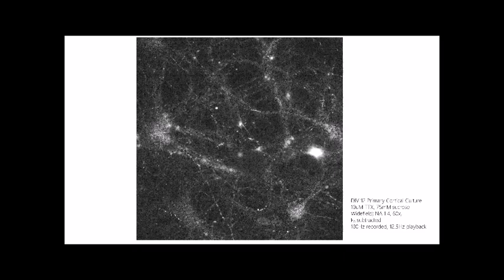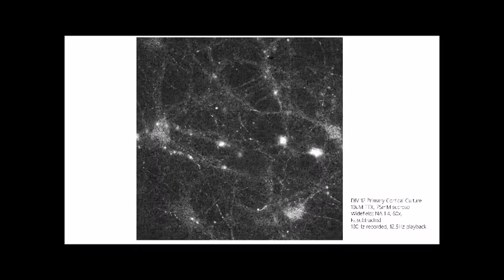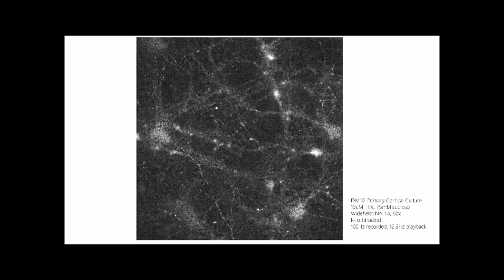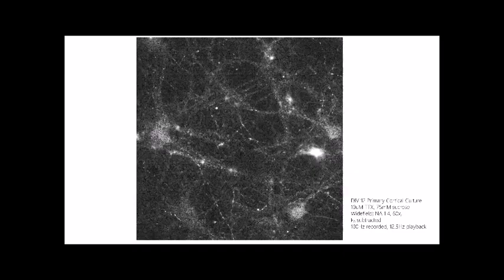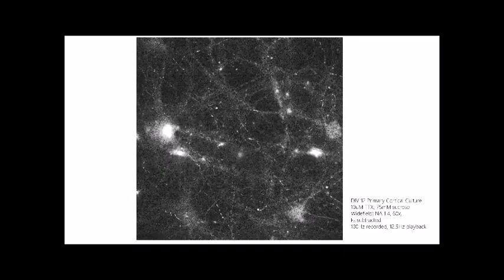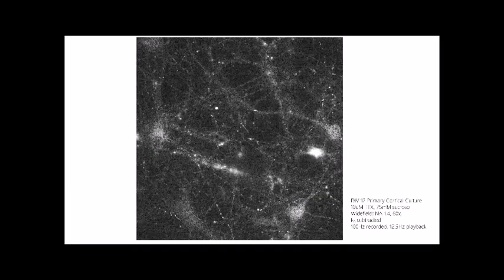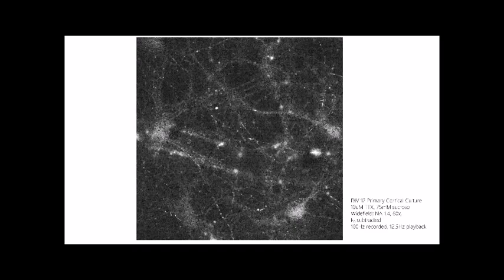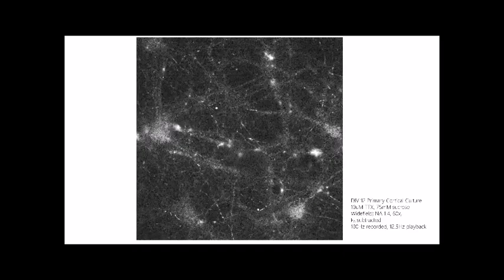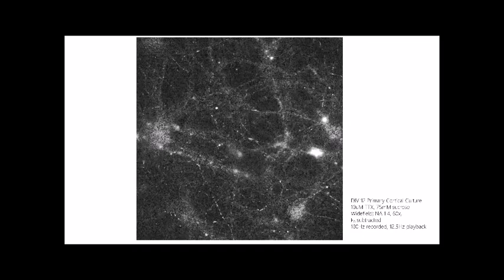So they're related, if you know what a mini EPSP is, which you can record electrophysiologically. These are closely related to those. But of course, now we can watch them in space on neurons, which is super cool. So this is a recording in culture. And we've done a lot of manipulations in culture to basically be able to better manipulate the amount of glutamate that's released, for example, or affect the rate of these minis in ways that have been previously done and measured electrophysiologically.